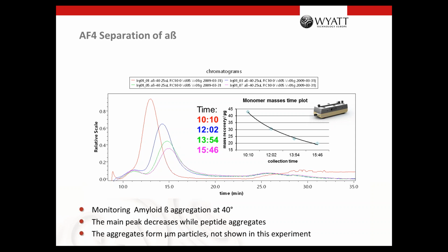Okay. How much work do I have to invest to establish an AF4 assay for an unknown protein? Oh, that's not so easy to say. If it's really totally unknown, you can be lucky that you do 2 runs and the method development is finished.